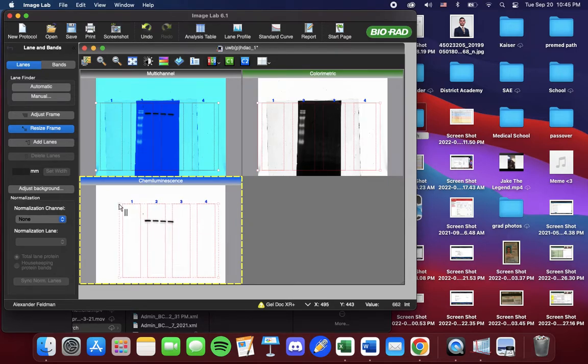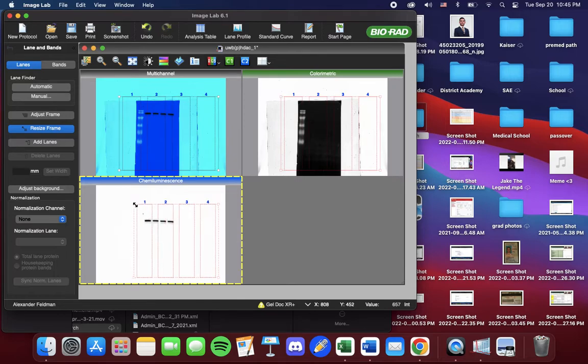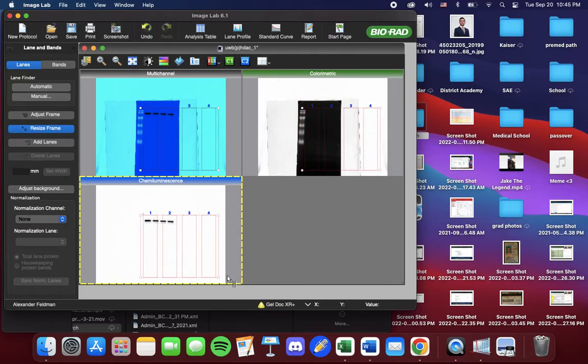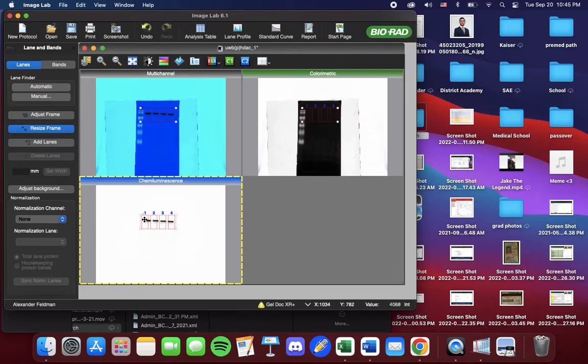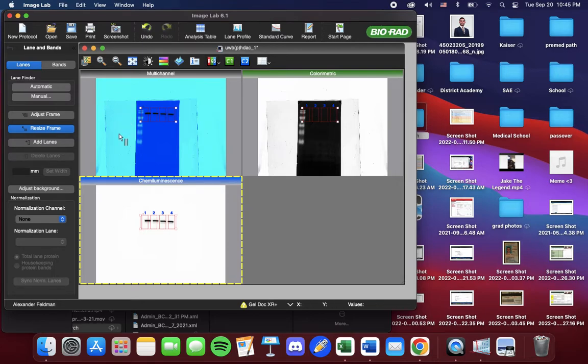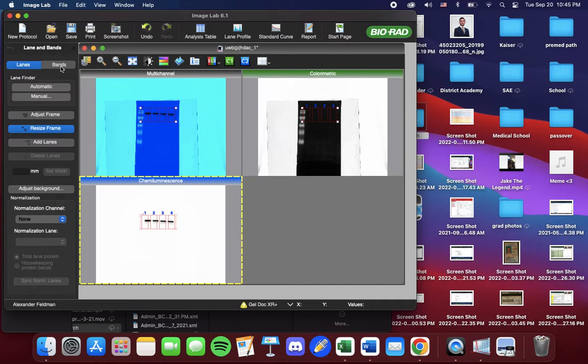We want to take the corners and drag it so that we can perfectly or near perfectly fit our blots. From here, now that I feel it's fine, we're going to go to Bands.